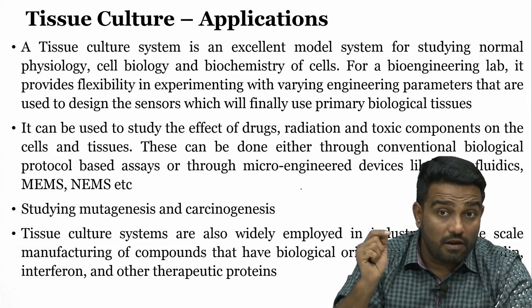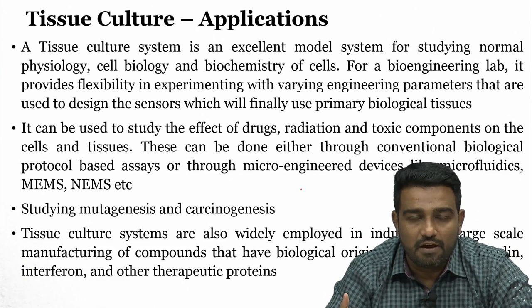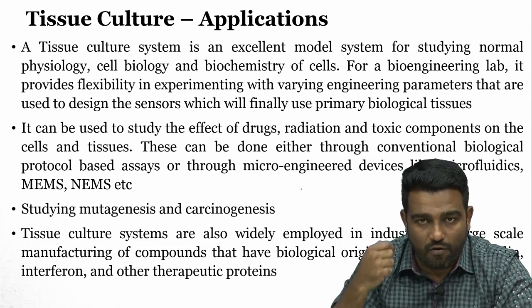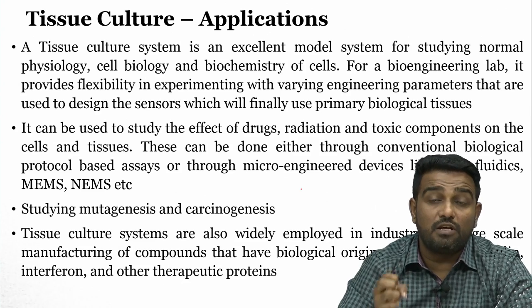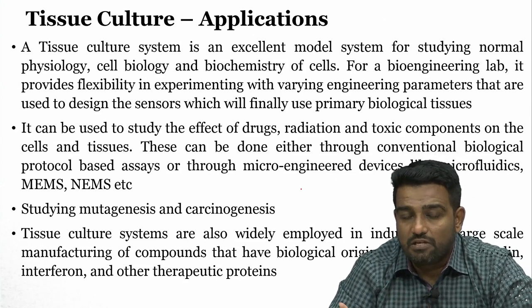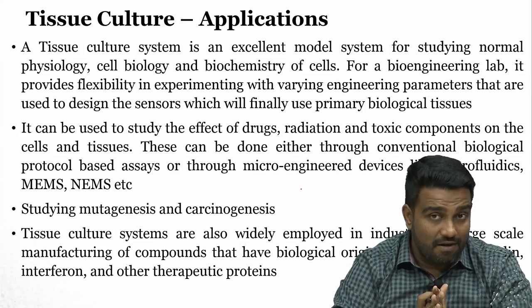It includes chemical engineering, material science, and electronics engineering, because it includes packaging of the device. Finally, we have to control the amount of liquid or drug flowing through the channel, such that it infuses into the cells, and based on the effectiveness of the drug, the cells will die or sustain. So, if the cell dies, we say the drug is more effective. How do we know cells are dying? Can we create a platform?